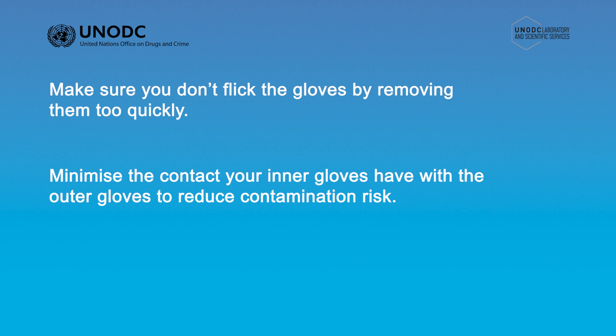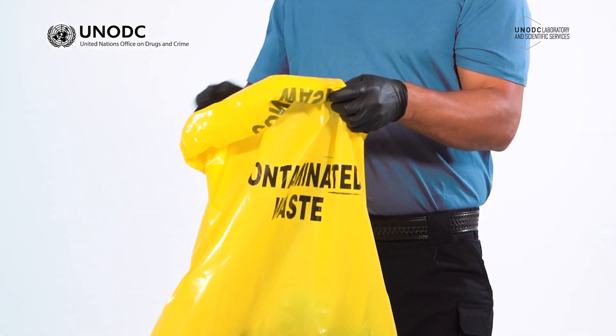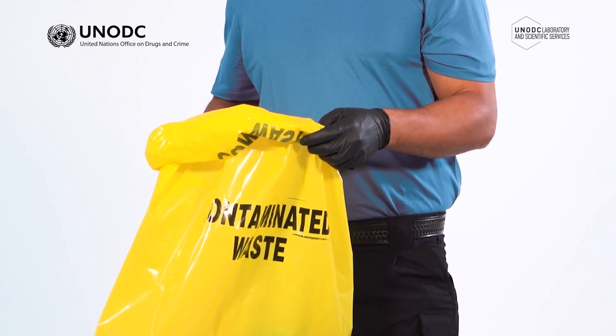Always remove one layer of gloves at a time, even if you have finished your task and you intend to remove both pairs. Once the outer gloves have been removed, immediately put them into a contaminated waste bag or bin for disposal.